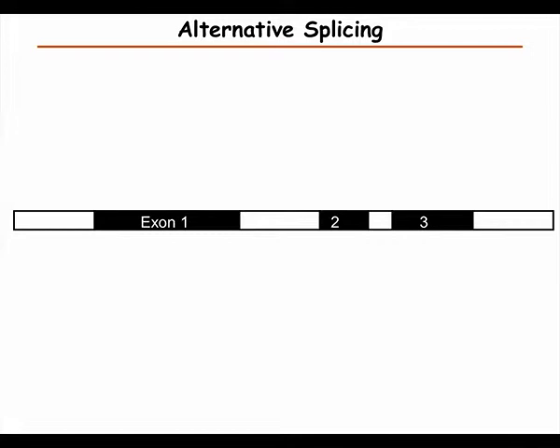We can't really say which splice forms are present or quantify them. And the reason is that with bottom-up we get peptides over the different exons, but in this case we can't tell if this is one splice form or a mixture of several ones.